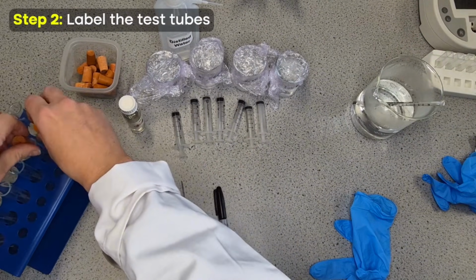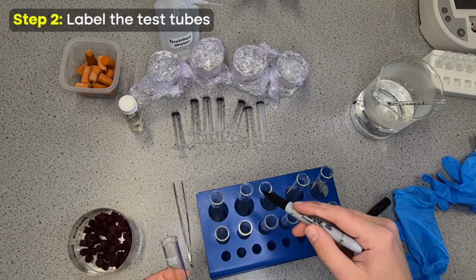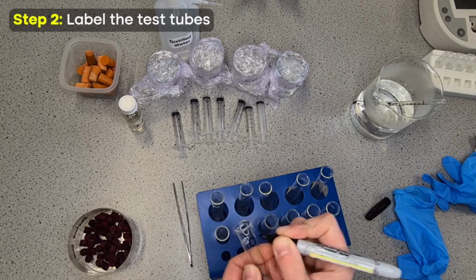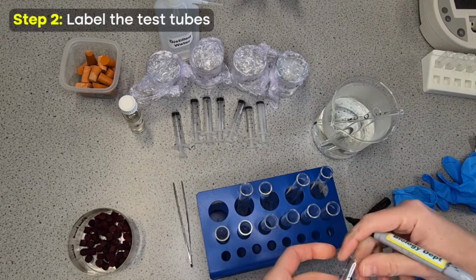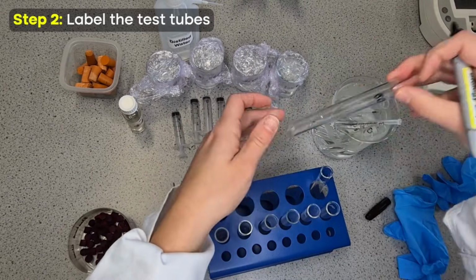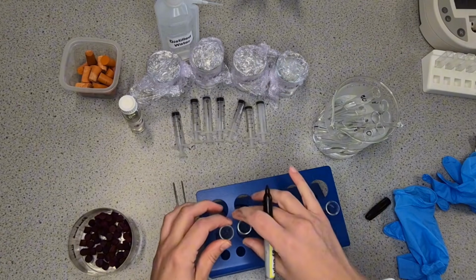The next thing then is I'm going to label my test tubes. And I'm actually going to double up and have a test tube for each concentration twice. And I'll point out why as we go through. That is my 0. I'll put that in the water bath for now. So 0%. This will be my 20%, 40, 60, 80, 100. I'm just going to label again on these spares.